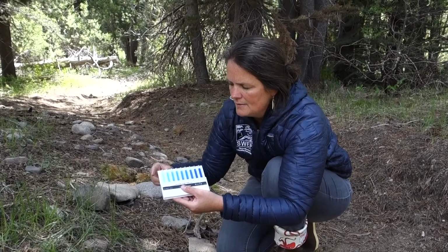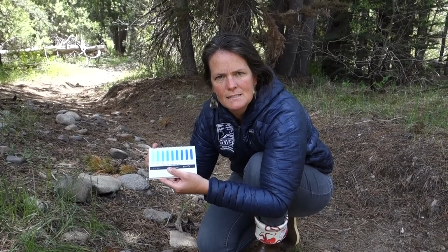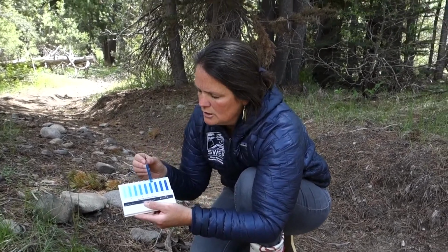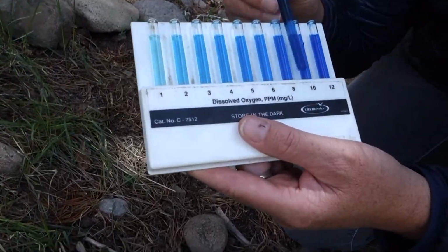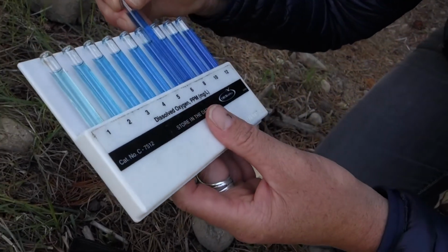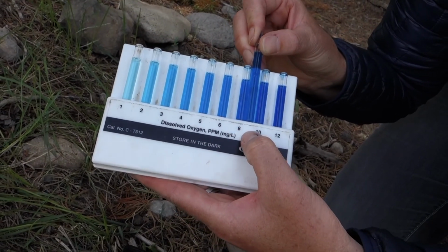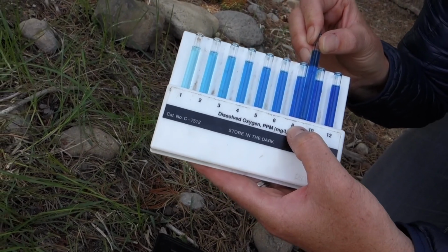scale here. And the scale goes from 1 to 12. The lighter shades of blue mean less oxygen, and the darker shades of blue mean a higher rate of oxygen. And you're gonna just put your ampule in alongside the scale to see which shade of blue you think it best matches. And I'm gonna say for me, it seems like it's pretty close to an 8. So I'm gonna record 8 parts per million on my data sheet.